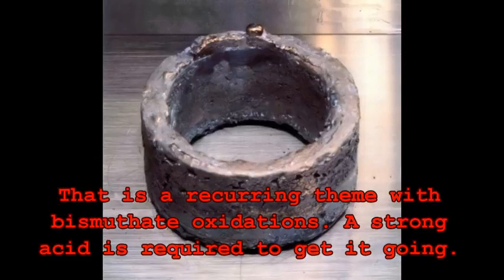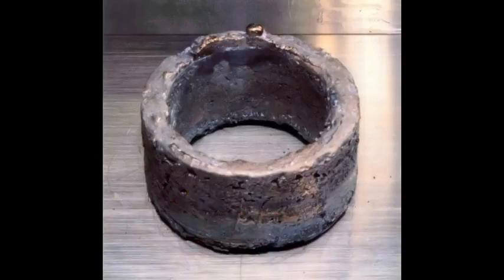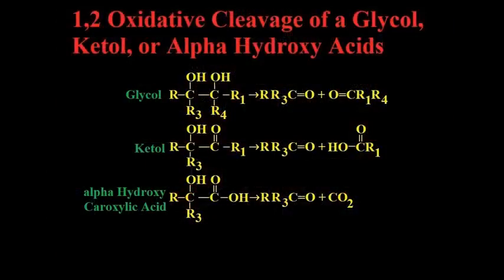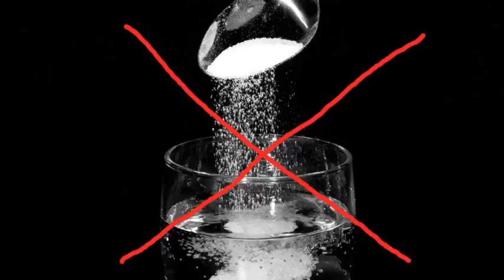Sodium bismuthate also has some utility in organic synthesis to carry out selective oxidations of certain types of organic compounds. One example of this is its use in the selective 1,2 cleavage of compounds containing an alcohol functional group directly adjacent to either another alcohol or carbonyl functional group, without oxidation of any aldehydes which may have been produced in the process.